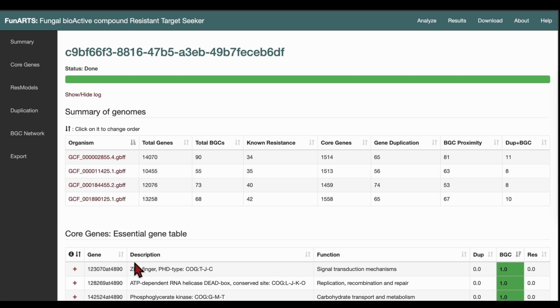We have already shown how these results are examined in the first section. If you wish, you can go back and review it again. The table is automatically updated once all analyses are complete. If the update does not occur, it is recommended to manually refresh the page. Our process is complete, and now we can take a closer look at our results.